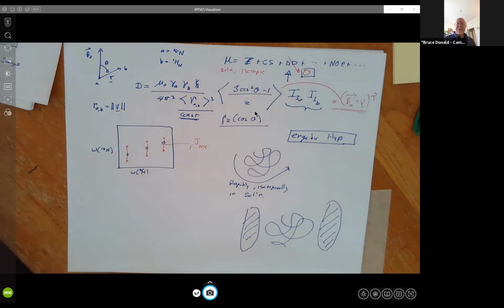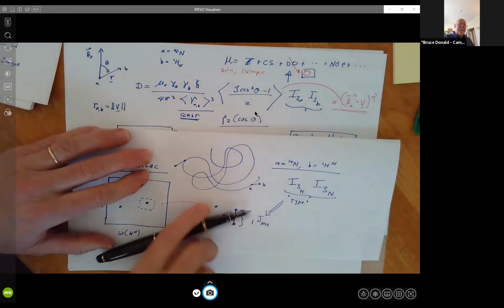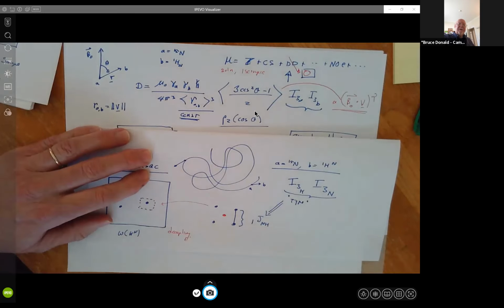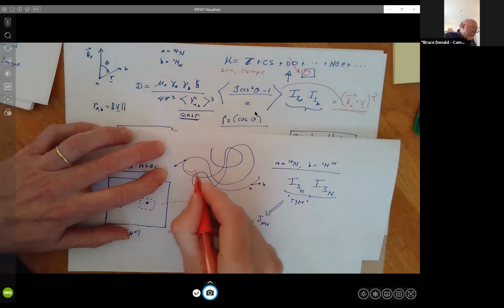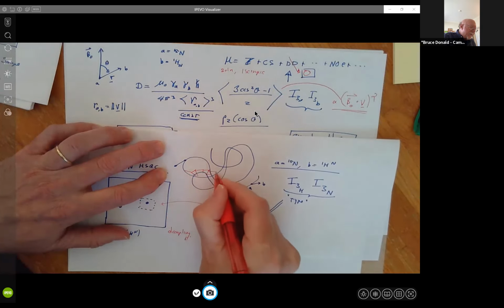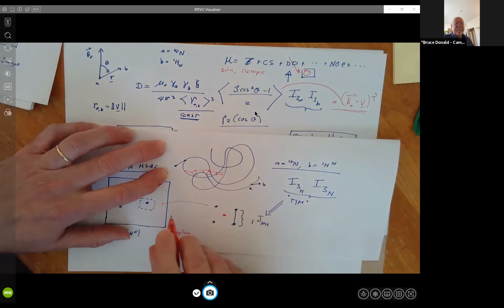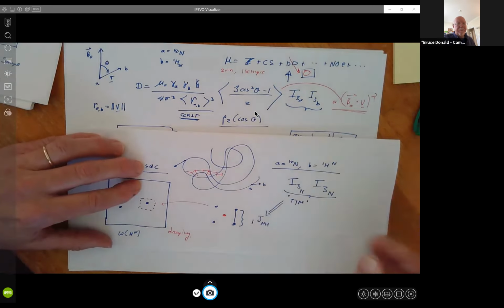And one of the things that's super cool about this is that it's our first NMR measurement in this class which is in a global coordinate frame. If you have a protein like this, you do NOEs, just like a surveyor trying to survey forests in Oregon or the Mississippi River, these little tiny NOE measurements, these little triangulations, error can add up as you go through making these measurements. And by the time you get to the other side of the protein, you have accumulated error, and the domain way over here might have a totally different orientation in your model, which is incorrect.